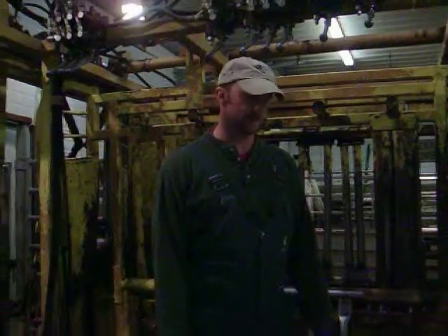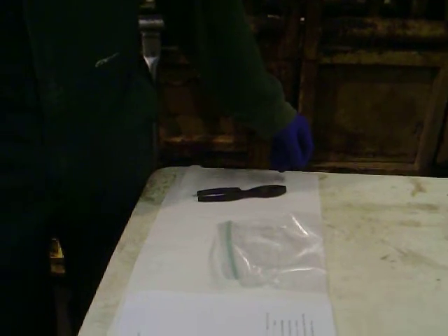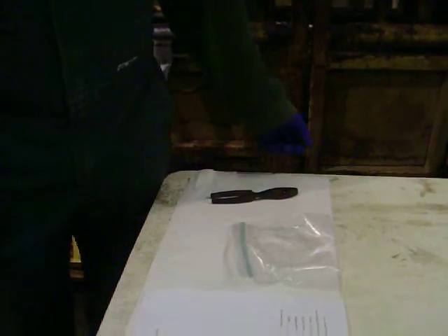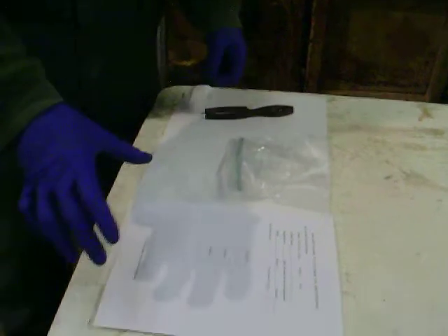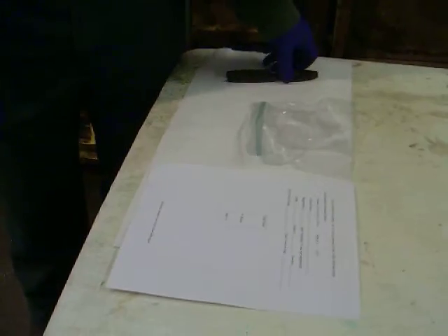Hi, I'm going to demonstrate how to pull tail hair for genetic testing. What you need is a clean pliers, preferably disinfected in disinfectant soap or alcohol, a Ziploc bag or a piece of paper depending on which lab you're going to send it to. Most labs require about 30 to 50 hairs, and that's more of an approximation.